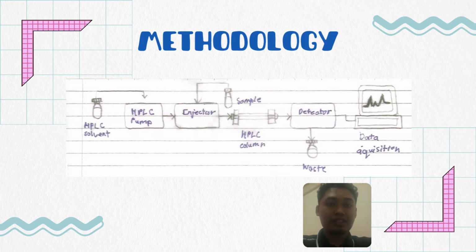The mobile phase carries the sample through the HPLC column. Separation occurs due to differences in analyte polarity and column interaction. Maintain column temperature as per the method. The temperature is set at 40 degrees Celsius.